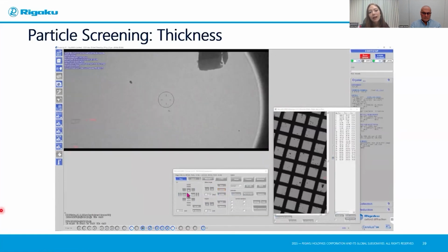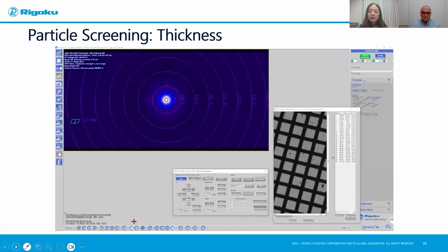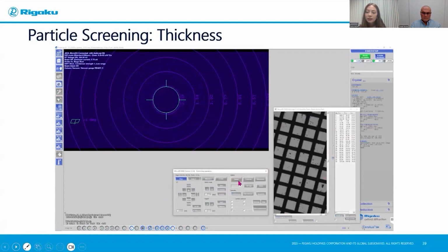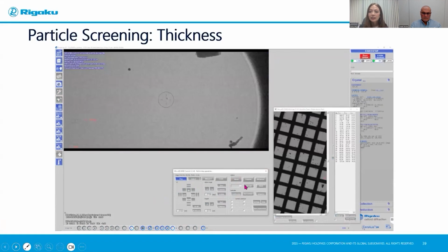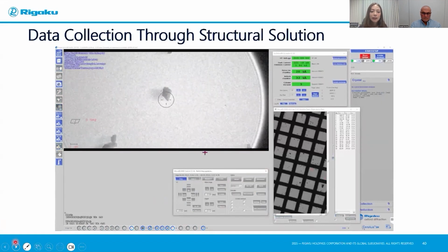So this is why we say that's the upper limit of what we can look at with electron diffraction. And it might surprise you that these very small particles, things that you can barely see, may actually still provide really nice diffraction. So in this case, the diffraction is a bit weak, but we can see that we have sub-angstrom resolution diffraction and something that is single crystalline, although I might need to extend my exposure time to get a good signal out of this crystal. But just to keep you oriented in terms of what types of particles to look at as you're going through and screening.